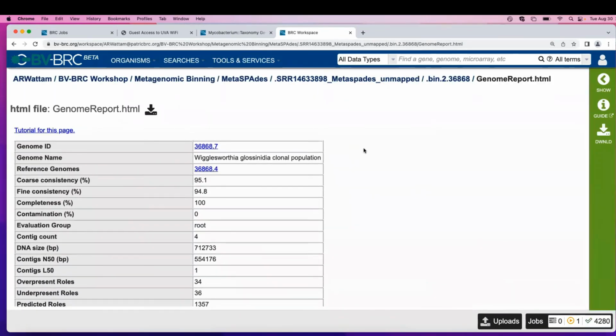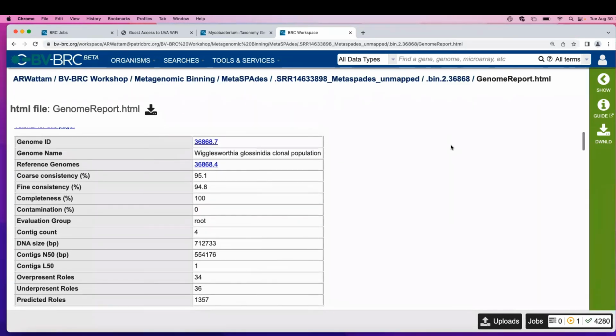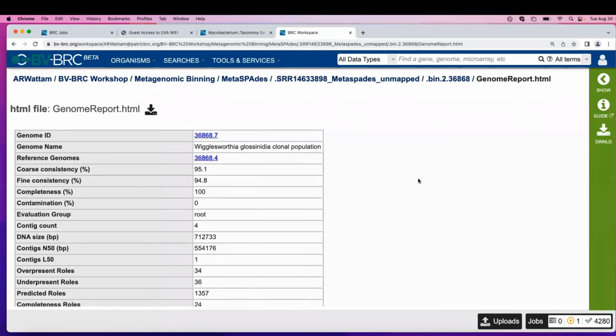If you were paying close attention before, one of the things that we didn't see Jim click on in the genome output was a file called genome report.html. Like the other reports, this is a detailed report on the output of the annotation of the genome. This is reported for every bacterial genome. We don't generate one of these for phages, I believe, is what we discovered. But this has our genome name.